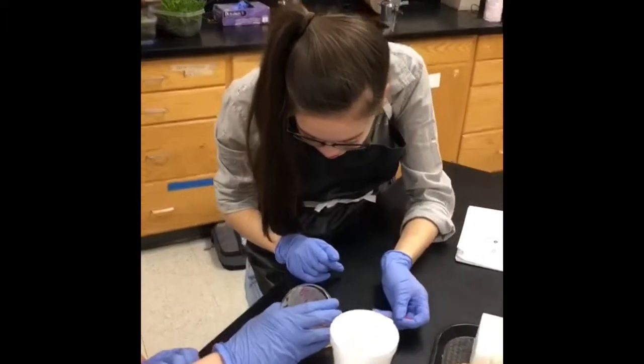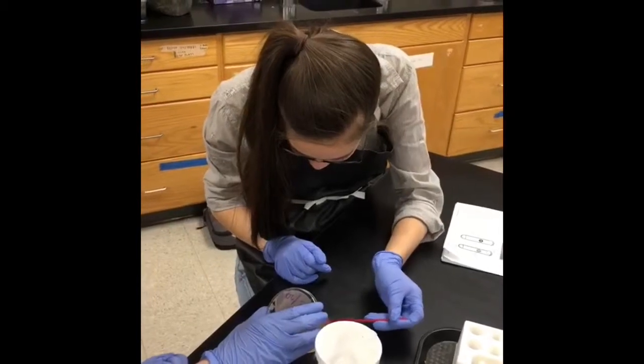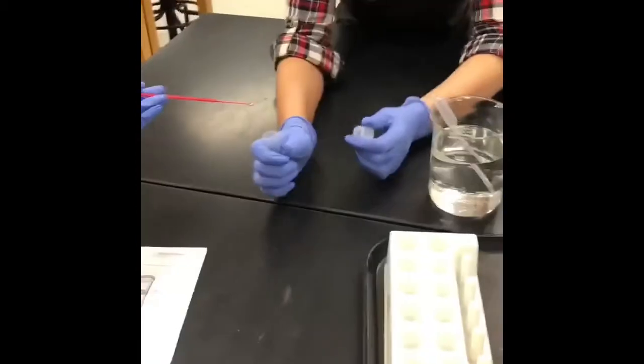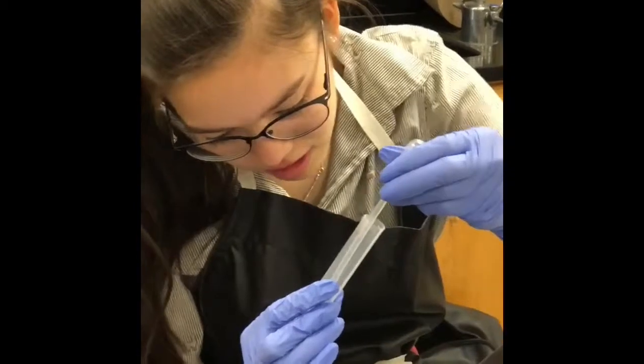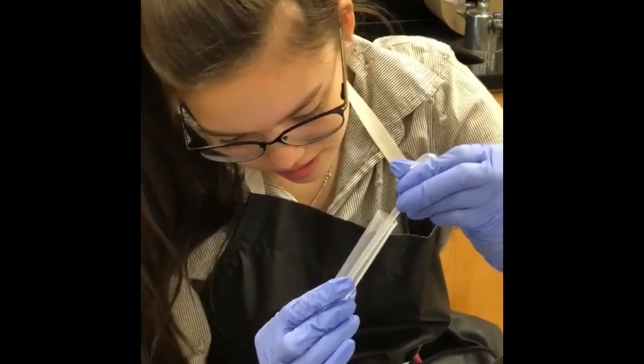Once that is done, transfer E. coli from the incubation plate to the plus plasmid tube using a sterile inoculating loop. Suspend the cells in the calcium chloride until homogenous by pipetting in and out of the fluid.